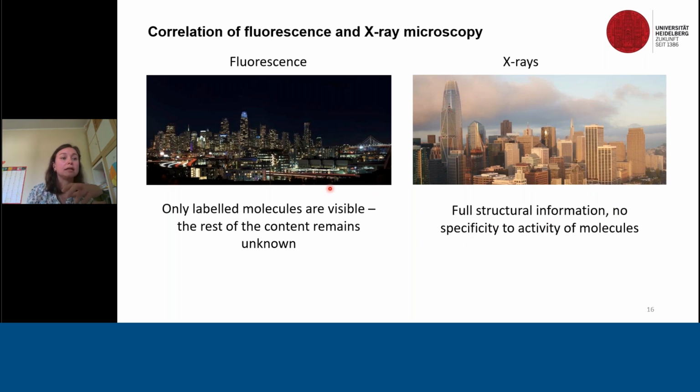On the other side, in fluorescence microscopy there are always those sparse dots, and if one does, for example, cell tracking, one has a feeling that the cells are propagating in space and there is nothing around. So we can actually not see all the information, but we for sure know, by this fluorescent targeting, that in this specific window here, gene A or gene B is active. And that information is extremely crucial and important. And the correlation of both, not just knowing that this gene A is expressed, but that it is expressed in these particular tissues within this organism, is extremely important at all different hierarchical scales.